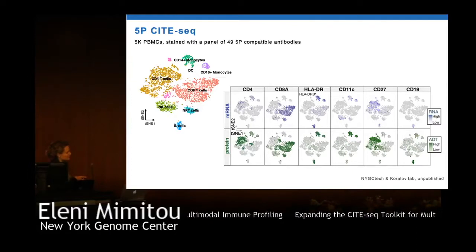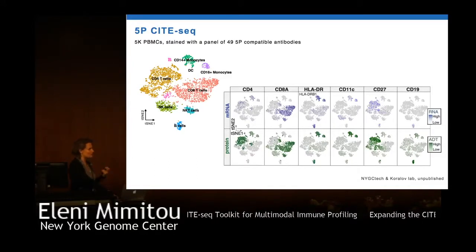We do face some background staining sometimes, and sometimes it's experiment dependent, but there are ways to control for that. We have some internal controls added into our experiments by spiking in cells of a different species and having some IgG controls.